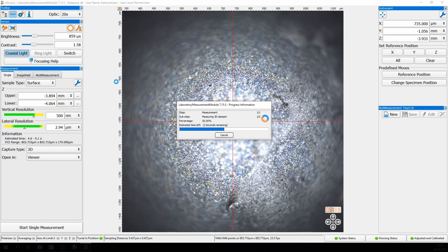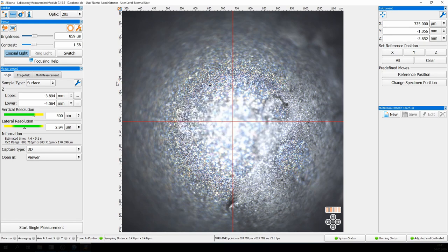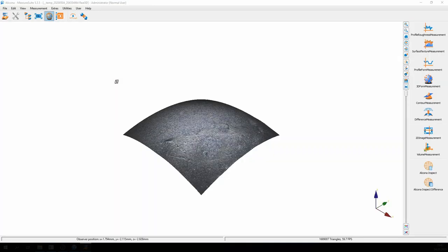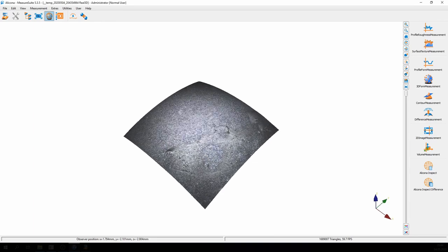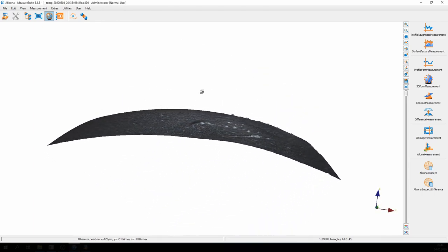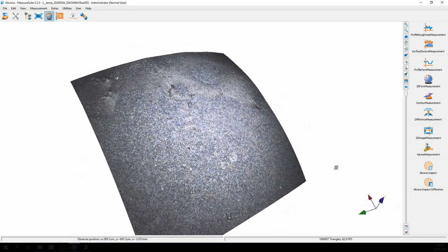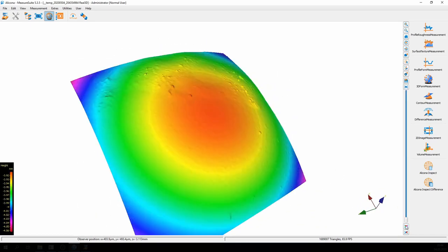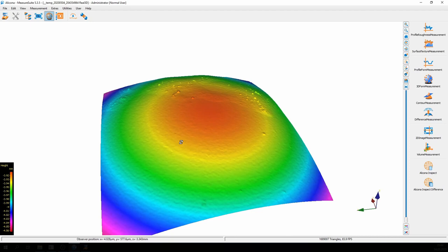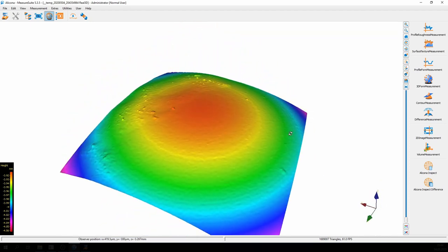I'm now starting the measurement procedure. The vertical scanning happens — for every point, this curve is generated, the maximum is found, and the 3D data set is calculated. Here we see the result: it is a sphere as expected. I can also switch to pseudocolor where the height of the data set is coded into color. This data set is now able to give the operator information about the form and the roughness, so further processing can be done.